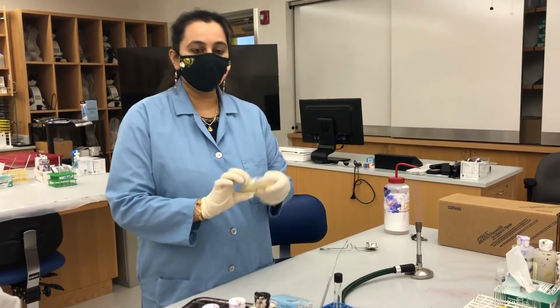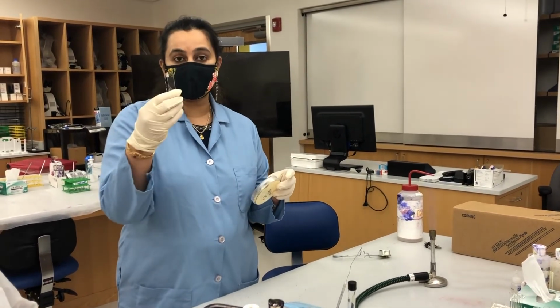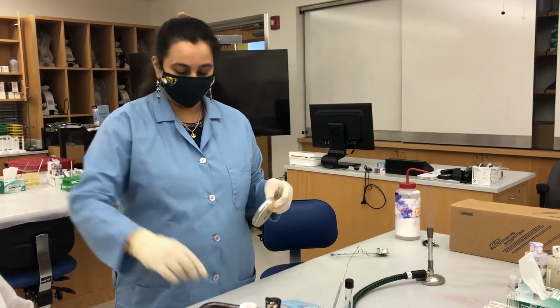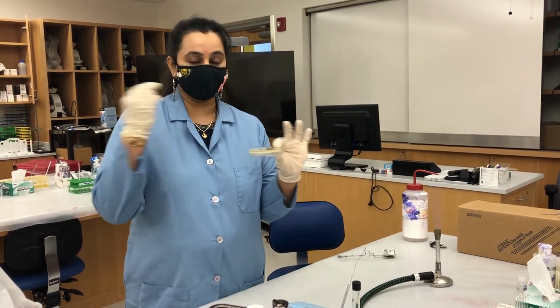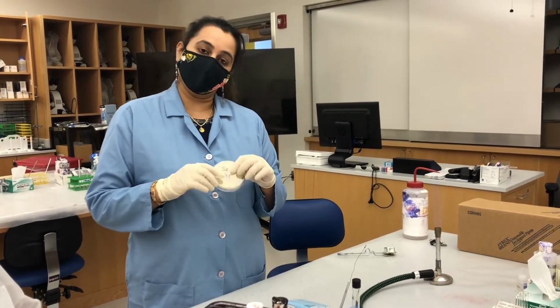The goal is to add enough cells on the slide, on the microscopic slide, so that we can stain it and look at those cells under the microscope. Okay, but the most important thing, be very careful when you're picking the cells. You don't want too many cells on your slide, but at the same time you don't want too little.